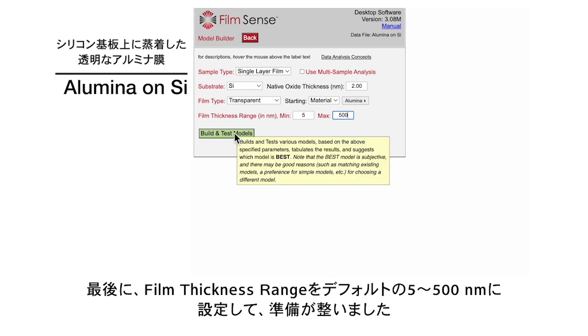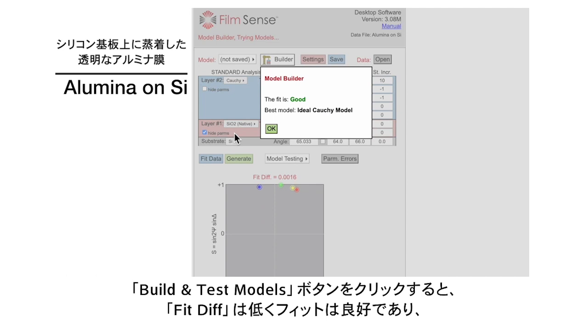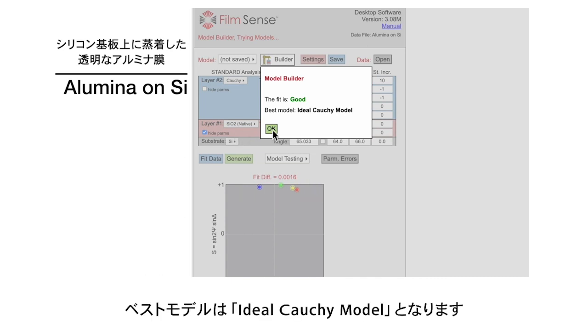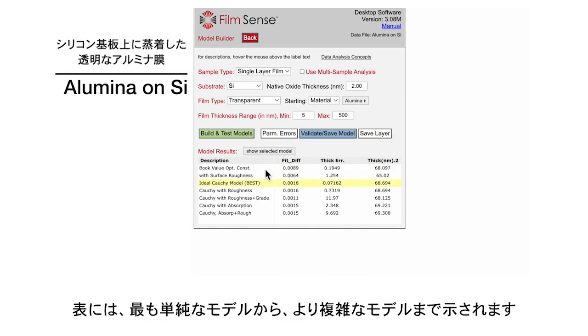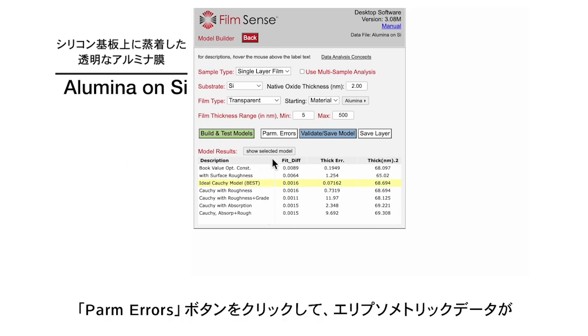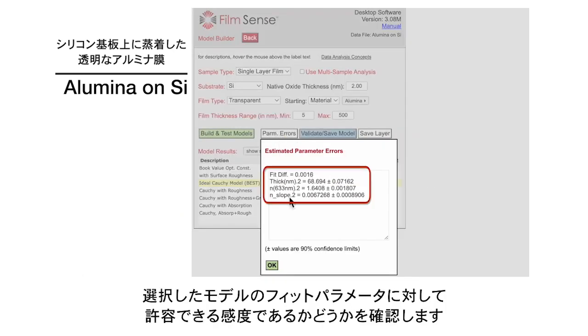Now we are ready for Model Builder to do its magic. Click the Build and Test Models button, and Model Builder suggests that the fit is good, which means that the fit diff is acceptably low, and the best fit model is an ideal Cauchy model. The model results are shown in the table, with the simplest model at the top, followed by models of increasing complexity. Click the Parm Errors button to verify that the ellipsometric data provides acceptable sensitivity to the fit parameters in the selected model.